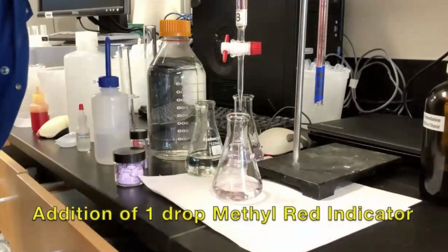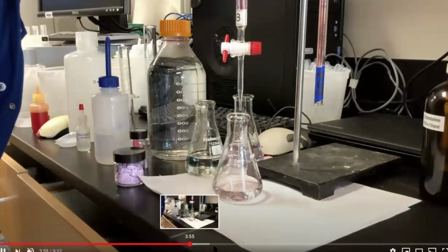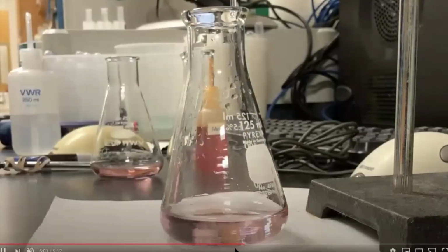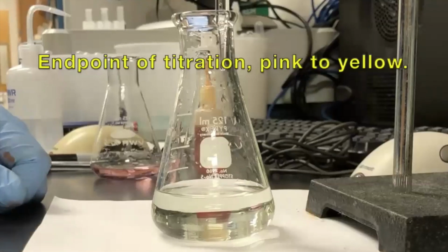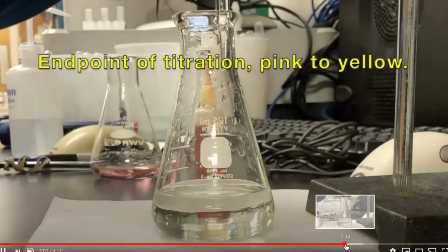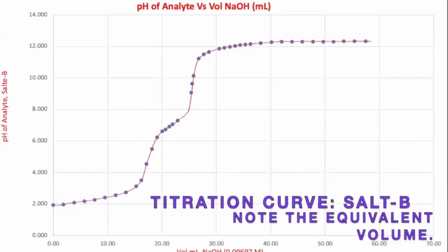Addition of methyl red indicator, and then I'm titrating this with sodium hydroxide to the endpoint, and this is what the endpoint will look like. And then I record the final volume of sodium hydroxide, endpoint pink to yellow. That's what the endpoint looks like. And then I record. This is the titration curve.